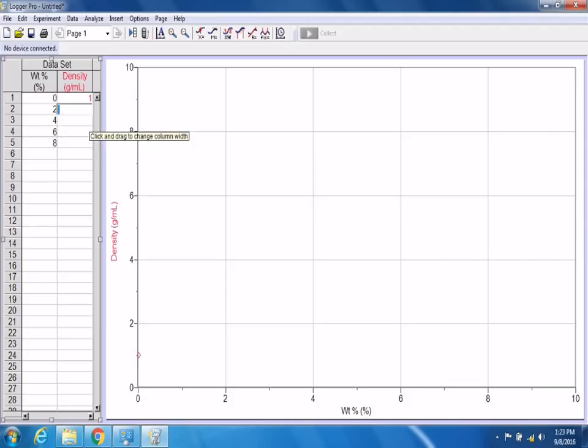And you guys told me it's increasing density. Now watch what happens when I start filling in these numbers. Look at the graph over here. It's so smart. So I'm going to go with the density. It's kind of outrageous, 1.23. Okay. I'm going to go with the density here of 1.8. That's really crazy. And 2.1. And 2.7.